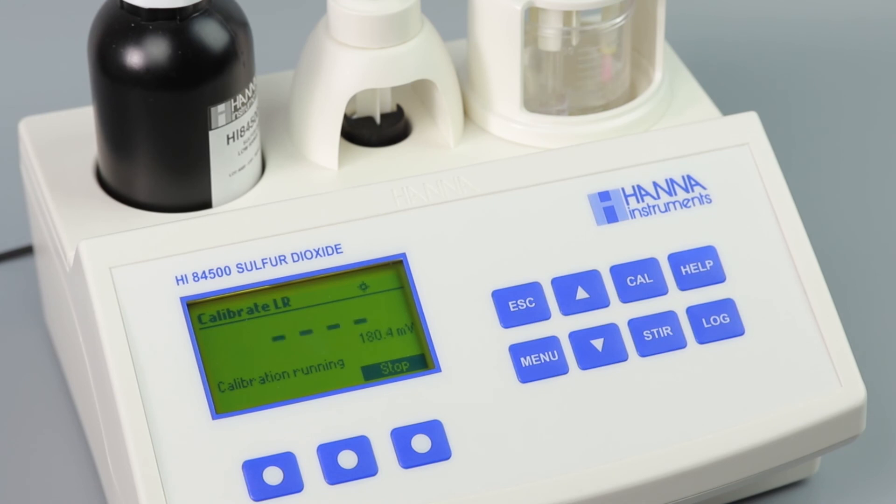Once complete, rinse the electrode with distilled water. You've calibrated your titrator and are now ready for the final step: taking measurements.